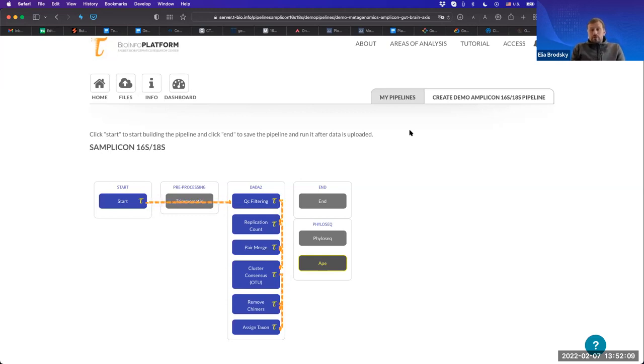And one of the challenges is going to be the lower we want to go on the taxonomy scale, the less information we might be able to get because of these hypervariable regions and their variation, but also because of the coverage and how precise we know which one came from there. Now, from this point on, we essentially have several different tables.